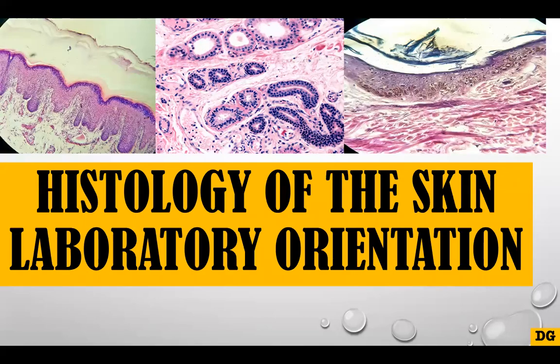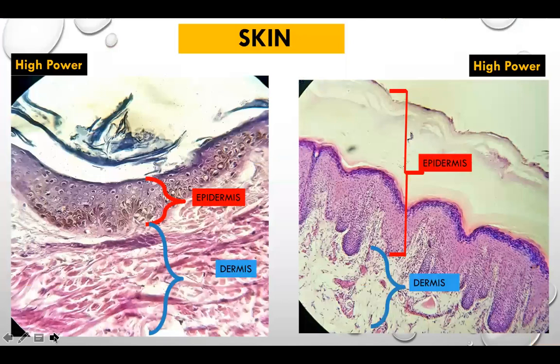Good day, everyone, and welcome to the laboratory orientation of the histology of the skin. The skin is composed of two layers. We have the epidermis and the dermis.